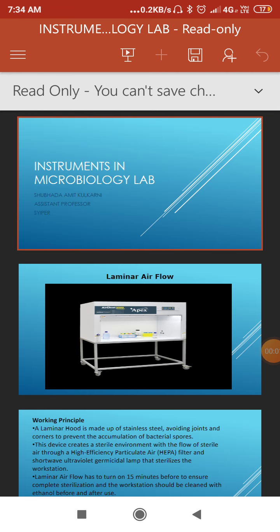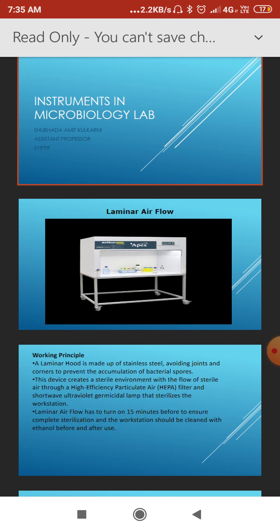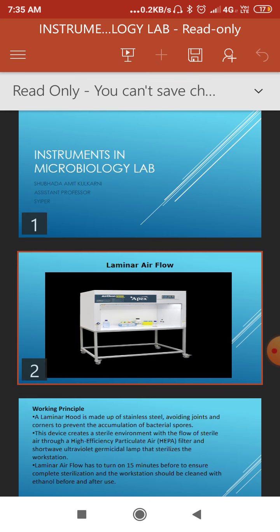Good morning everyone. Today we are going to learn about laminar airflow. This practical is embedded in the instruments demonstration series, where we previously learned about the hot air oven, incubator, and autoclave. Today we are going to learn about the laminar airflow.